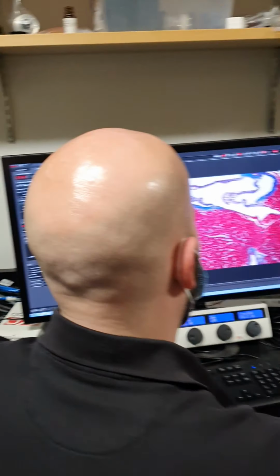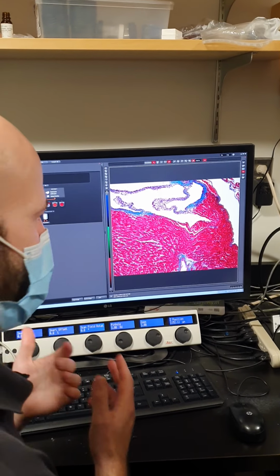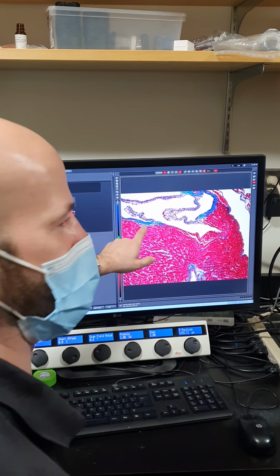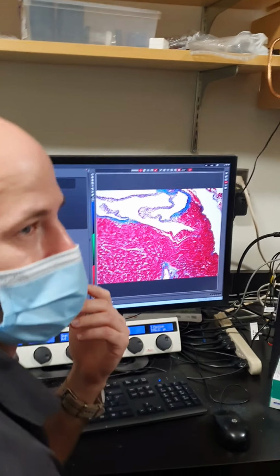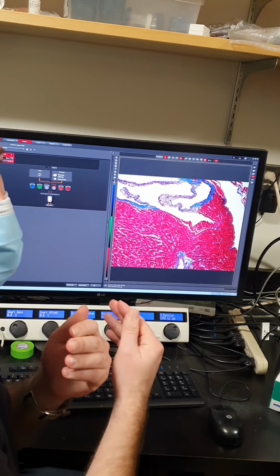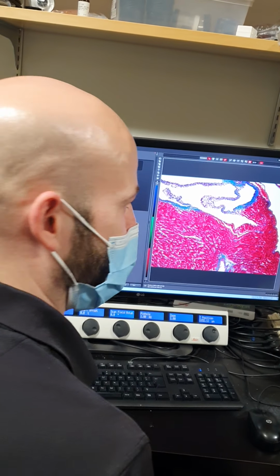Yeah, for example, if you're trying to find what percent fibrosis is in your heart section in a mouse which has had some sort of injury, and you're going to be using software to determine how much of the area is healthy tissue versus how much is fibrosis, based on extracting the red area and the blue area, you want those colors in your images to be accurate. And you want it to be consistent between all your samples so that you can create one set of settings and then apply that to your whole batch of images and get consistent results for all the images.